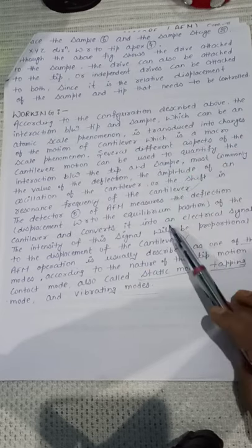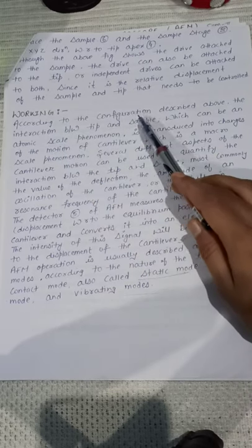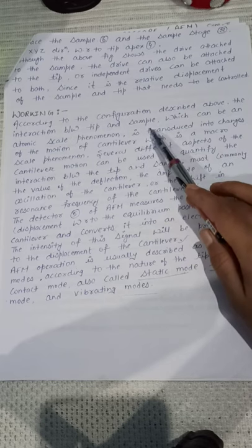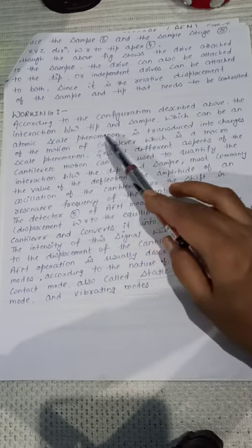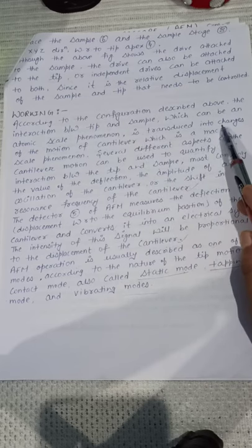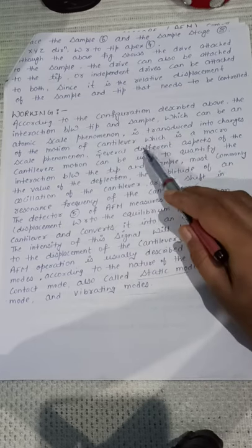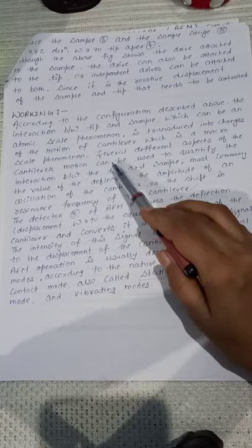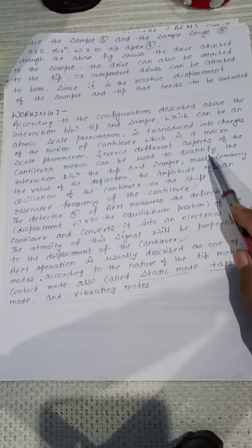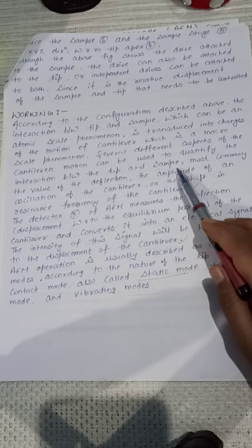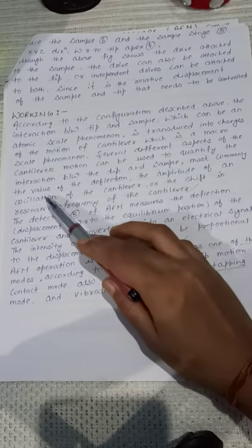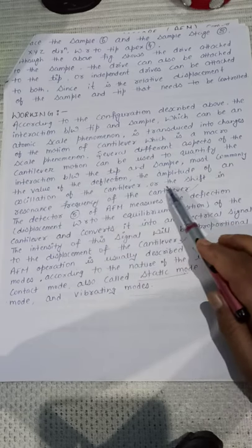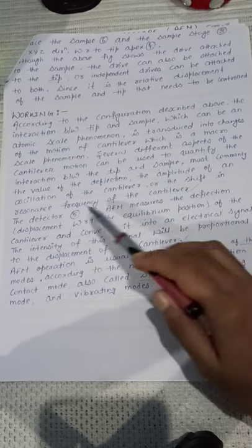Now come to the working. According to the configuration described above, the interaction between tip and sample, which can be an atomic scale phenomenon, is transduced into changes of motion of the cantilever, which is a macroscale phenomenon. Several different aspects of the cantilever motion can be used to quantify the interaction between the tip and sample. Most commonly the value of the deflection, the amplitude of oscillation of the cantilever, or the shift in the resonant frequency of the cantilever.